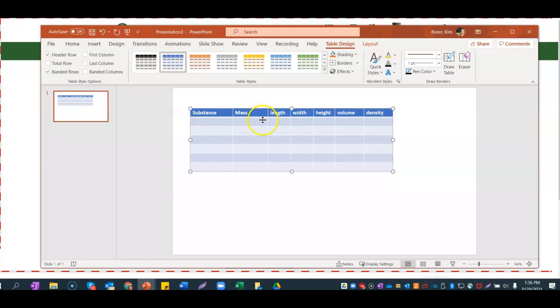So you'll kind of see really quickly that we only need 1 of these, length, width, and height, in our data because it's a perfect square. They're all going to be the same. So we're starting out with, we'll fill this in. We have silver, we have tungsten, and we have platinum.